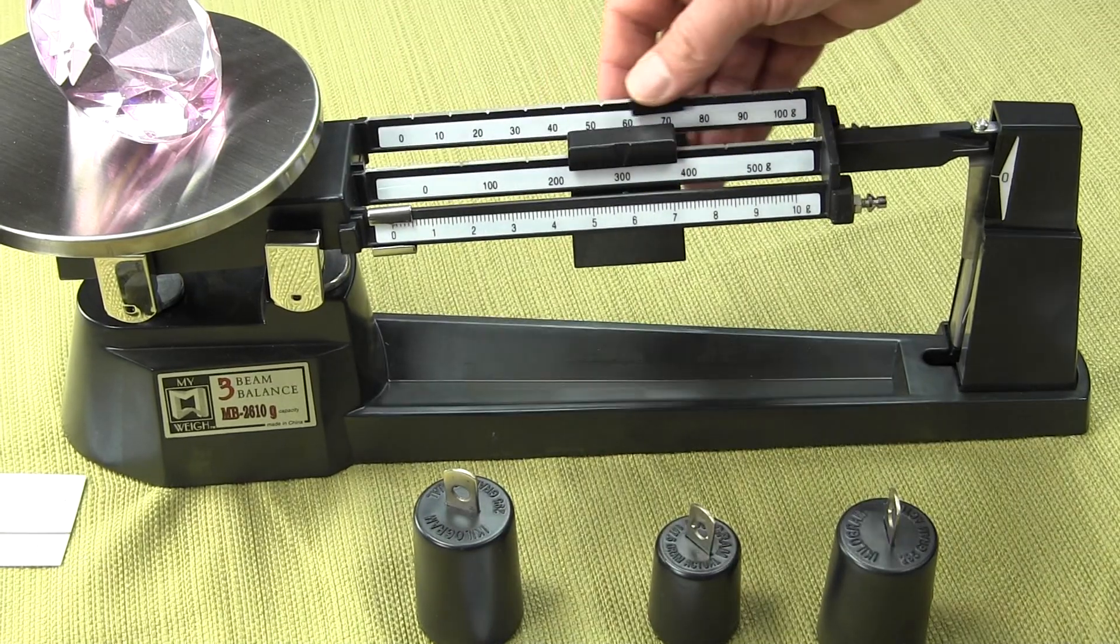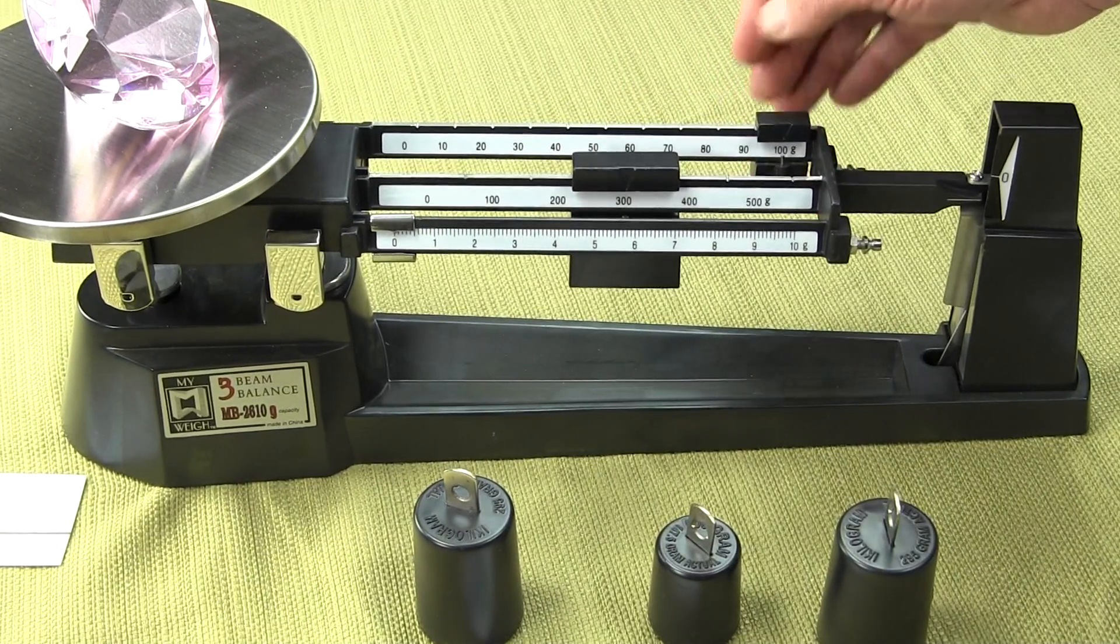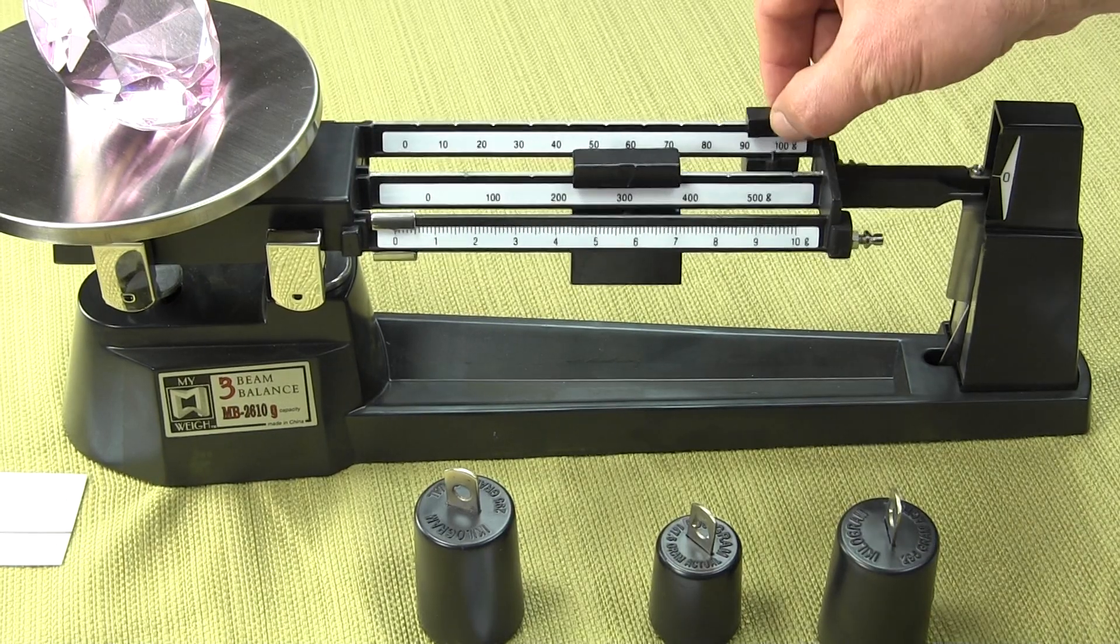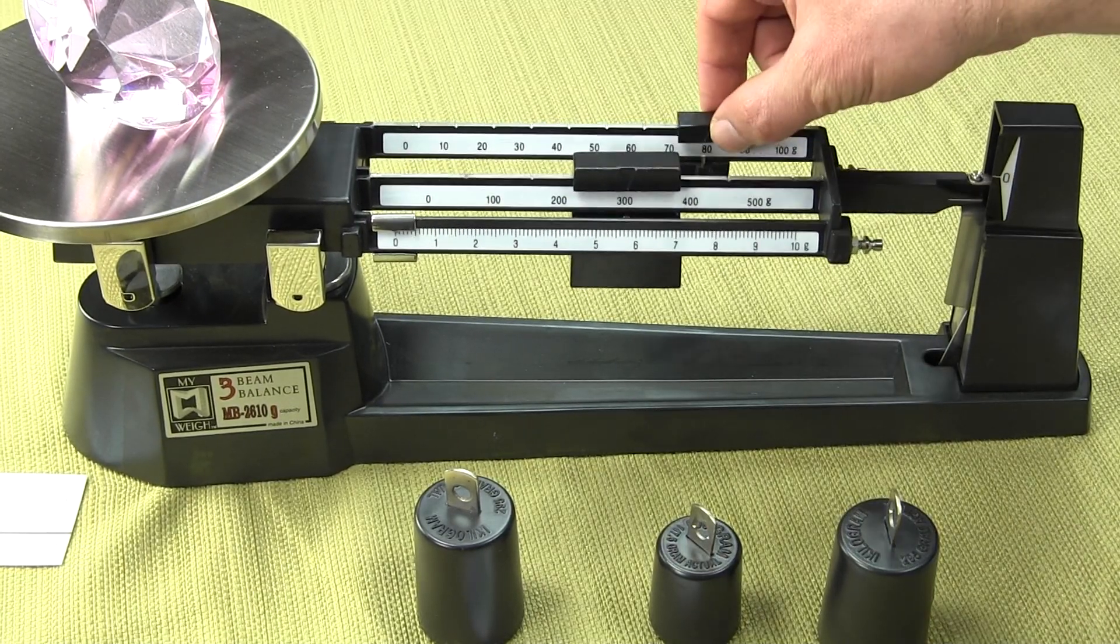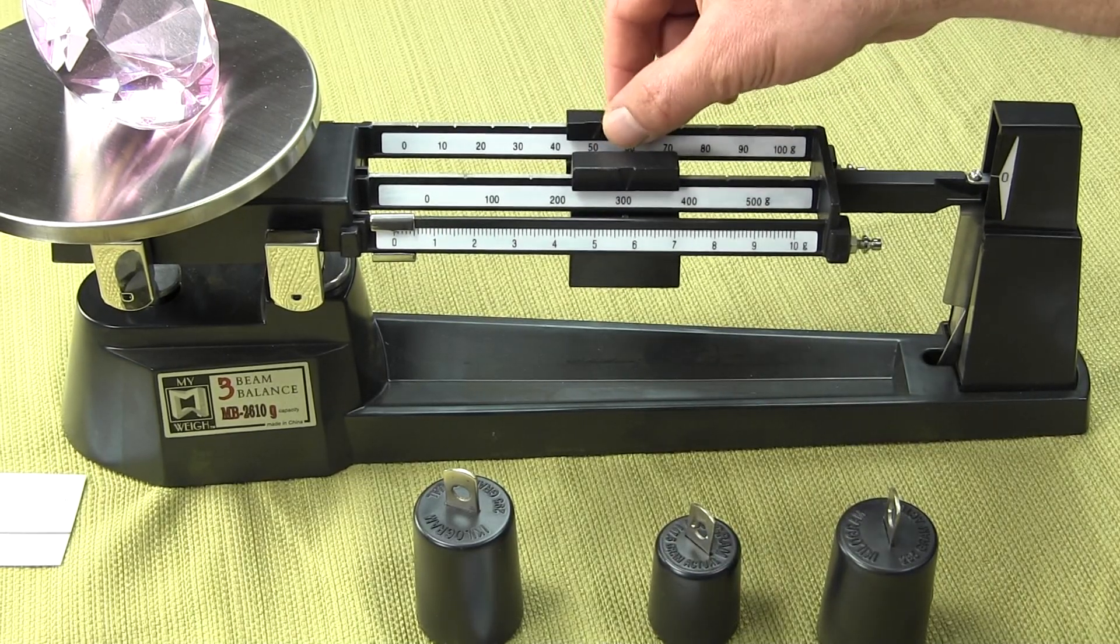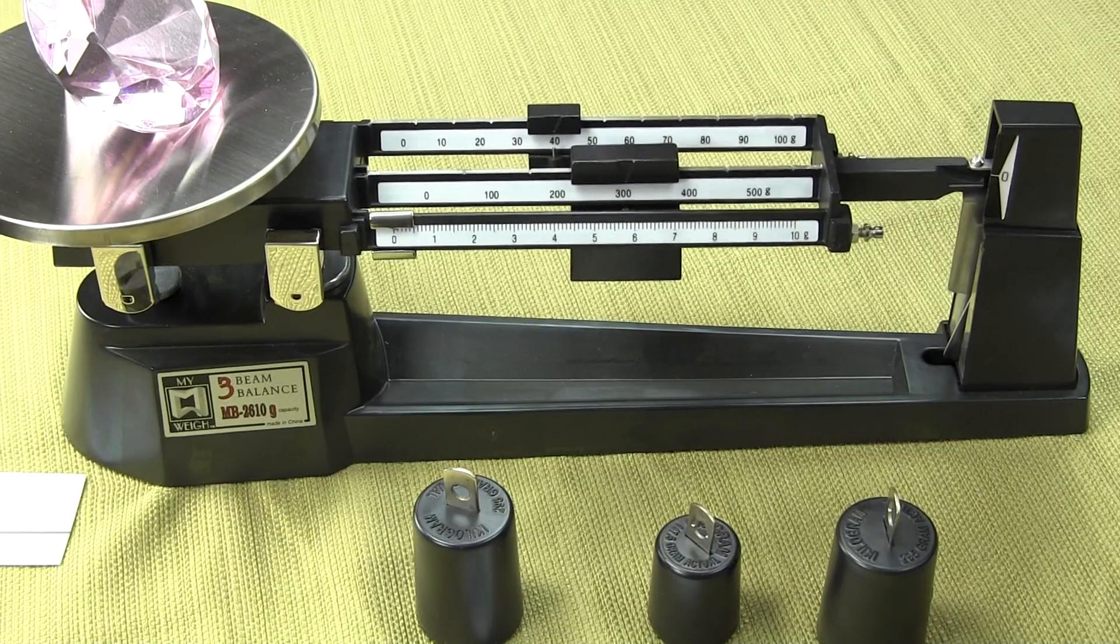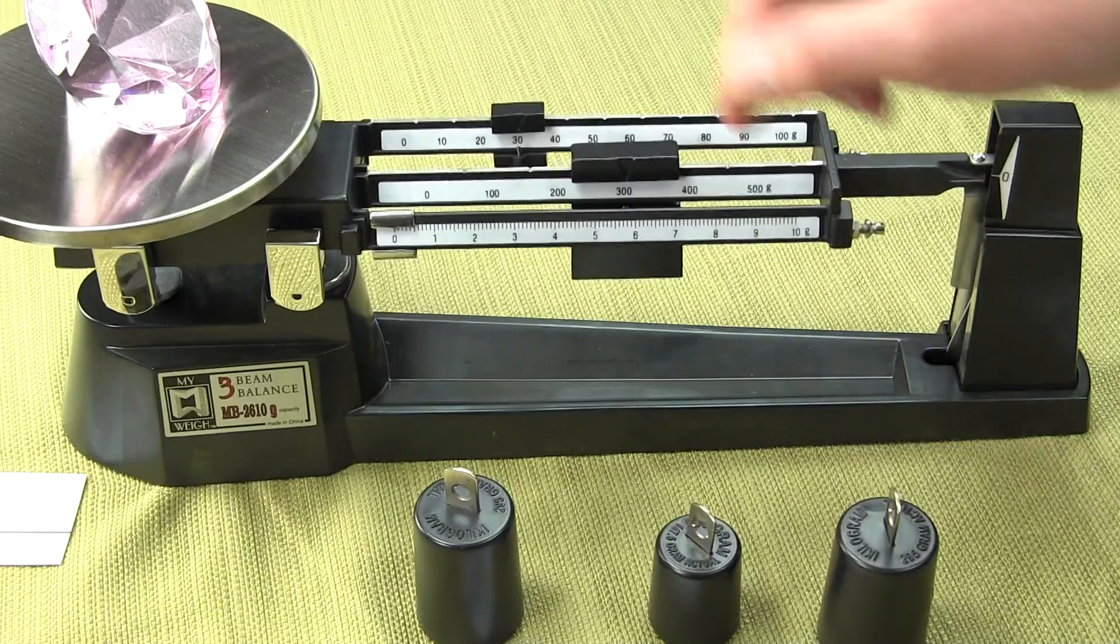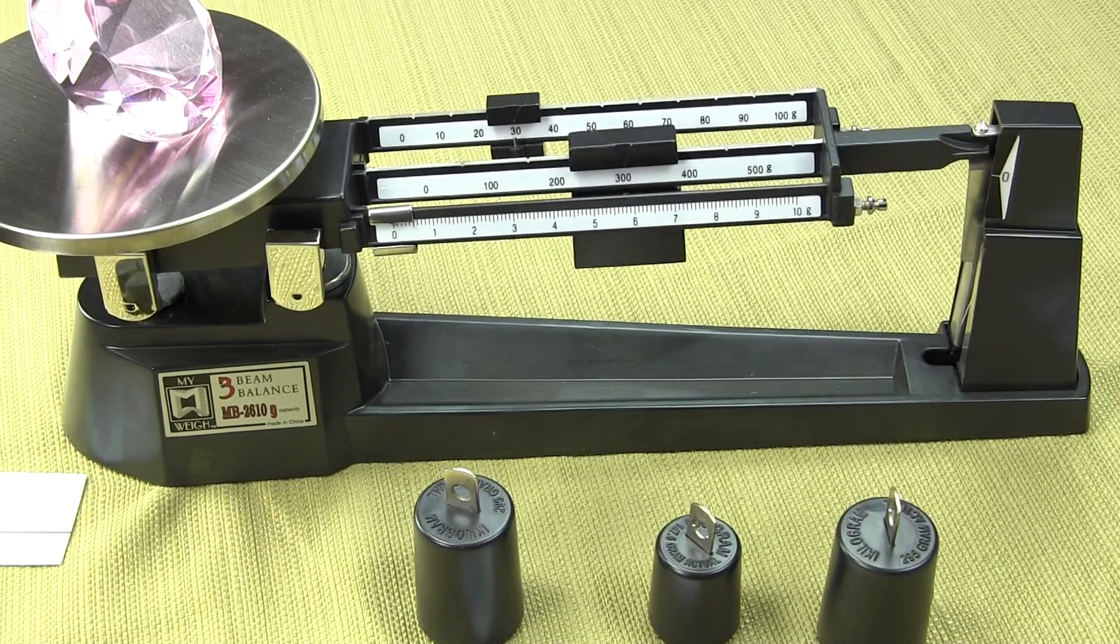Now we want to go to the beam all the way to the rear. We put it to 100, the beam is down, it's too heavy. Now we start sliding it back until the beam goes up. At 40, it's too much. So at 30, now the beam is up.